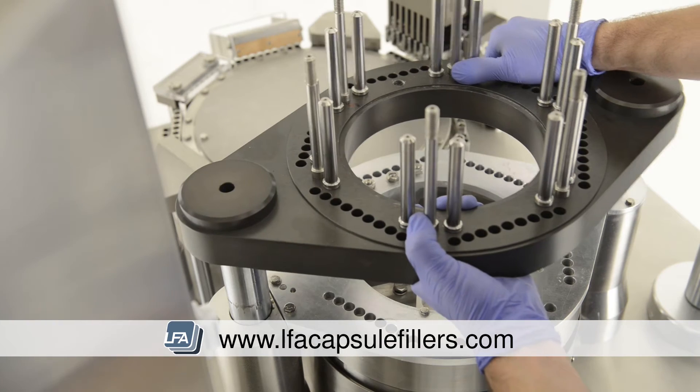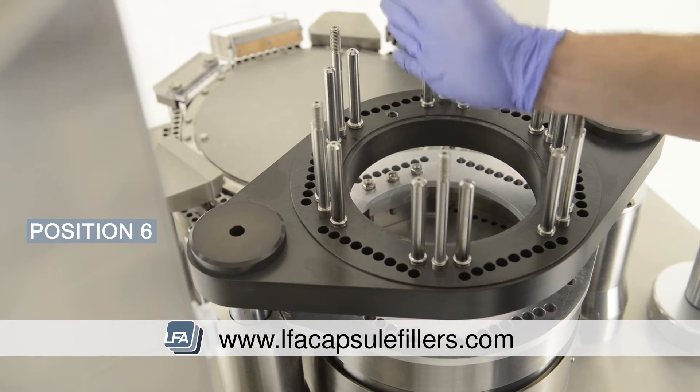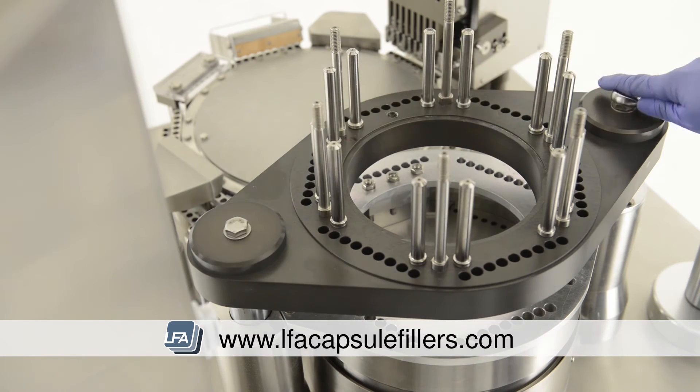Next, replace the middle section. Make sure this hole is facing the main turret of the machine in position 6. Now replace the two 90mm bolts at either side of the middle section. These again can be fully tightened.